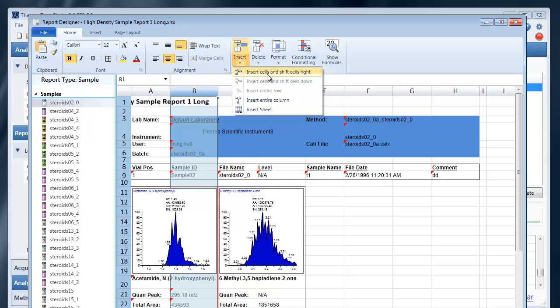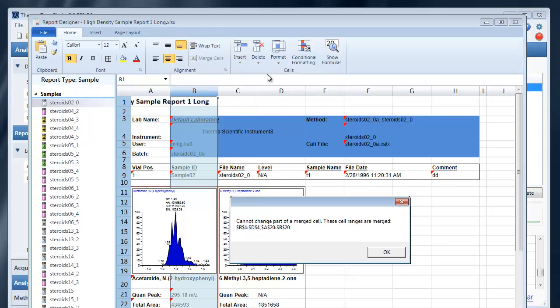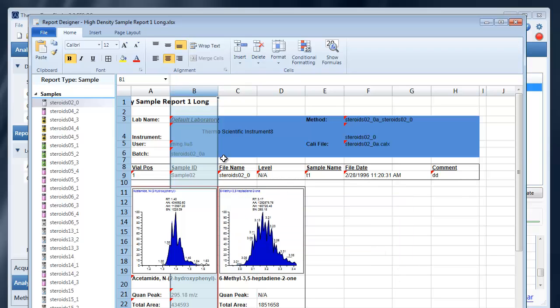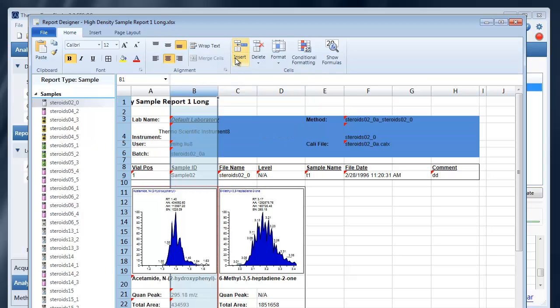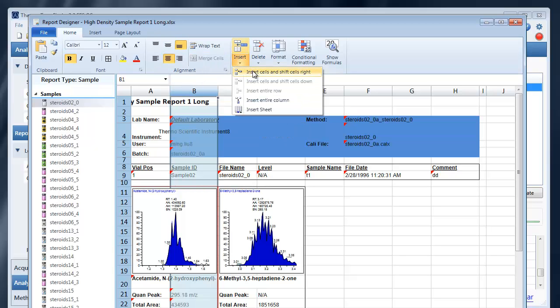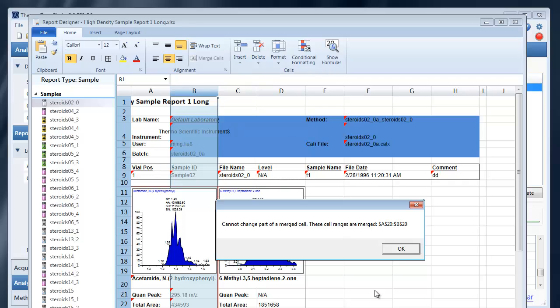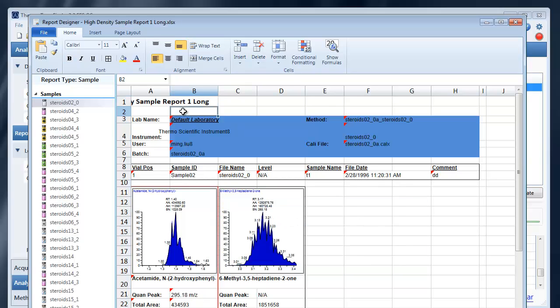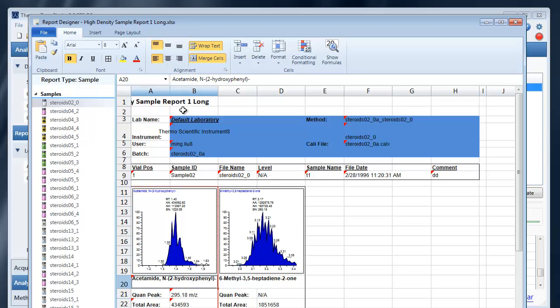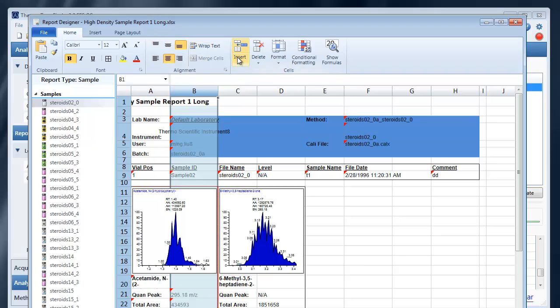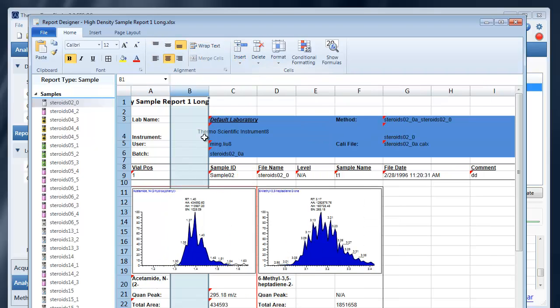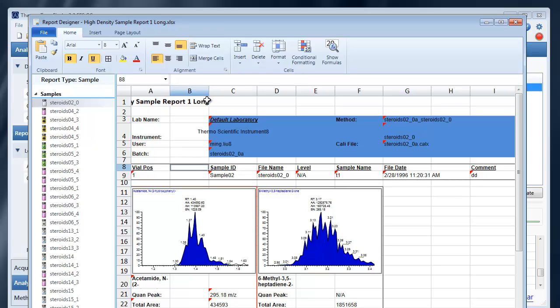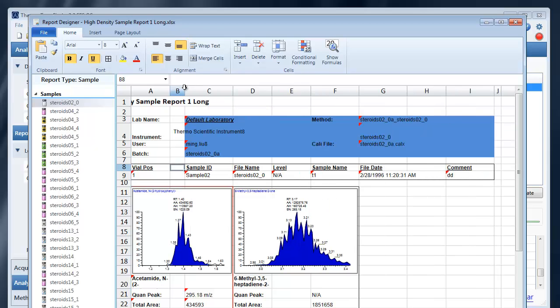And if you wanted to insert an extra column. It's telling me I need to unmerge this. Now I can insert. I still have a merged cell, A20 through B20. Right here. There we go. Now I'm able to insert that column and adjust my template accordingly.